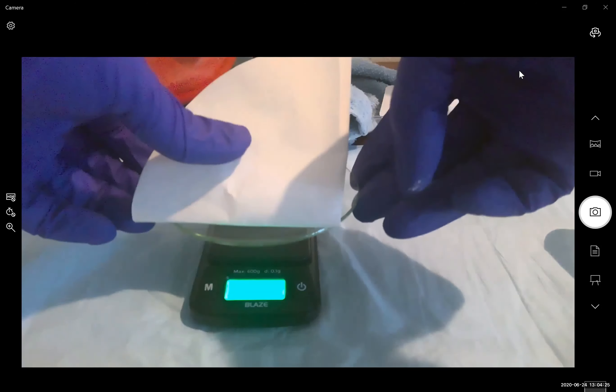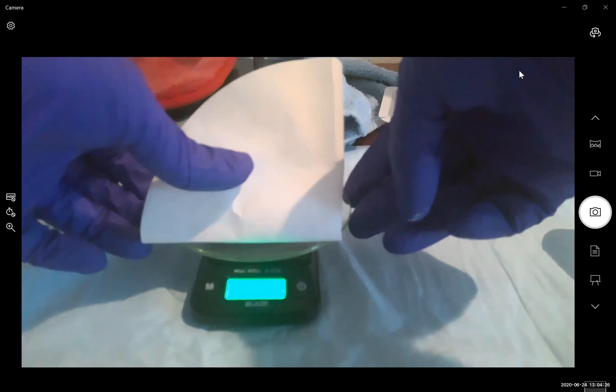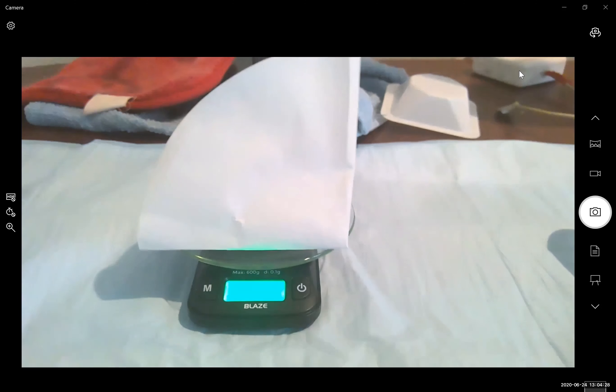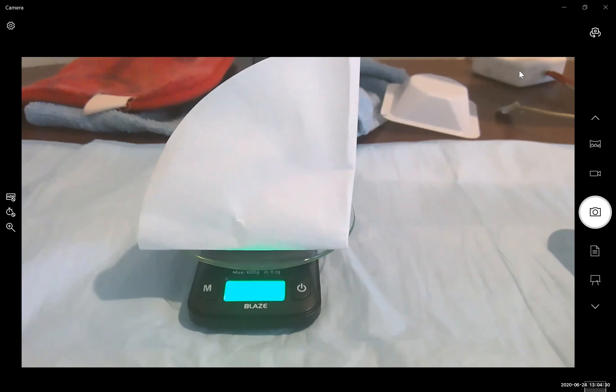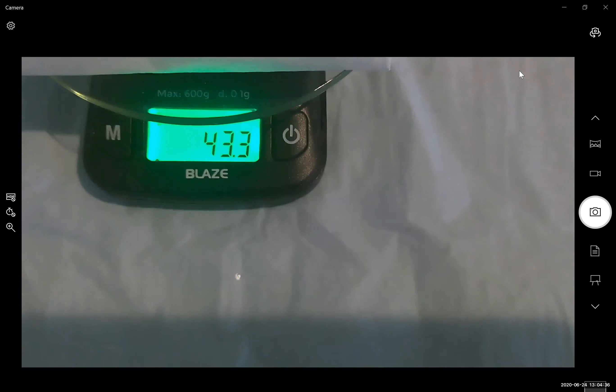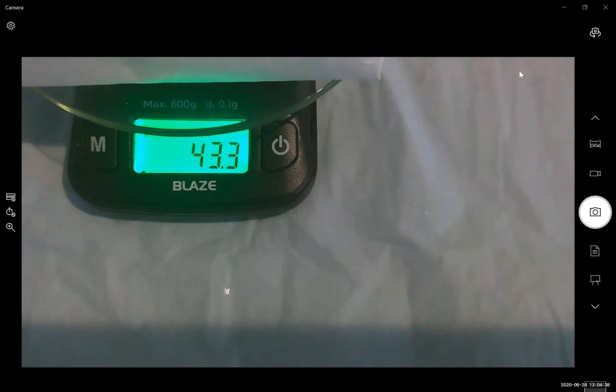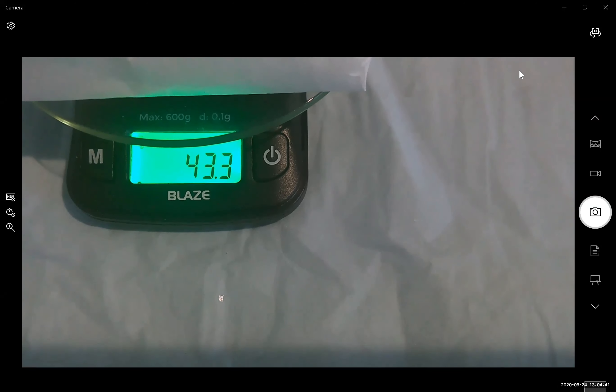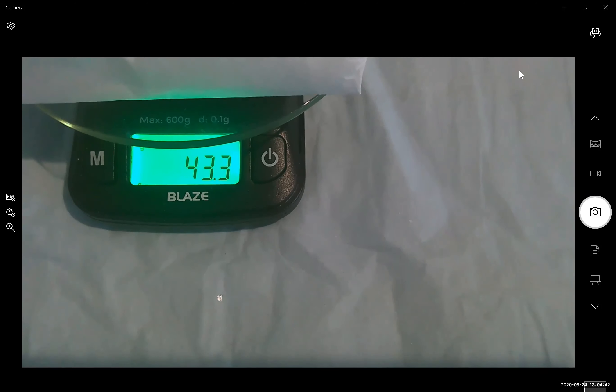So here is the mass of our weigh paper, solid and watch glass. So I'd like you at this time to record the mass of our solid, our weigh paper and our watch glass.